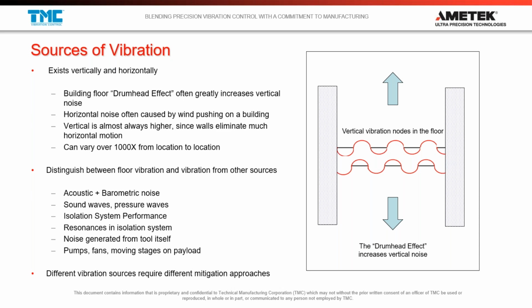So later on, I'll talk about mitigation systems, and the performance of that system is going to affect the vibration you see when you take a measurement on an isolated surface. Instruments themselves generate noise. A lot of the electron microscopes and other tools that we talked about in the earlier slides have their own pumps and motors and even mechanical arms and robotic components that might be generating their own noise. So you always have to watch out for noise generated by the instrument itself.